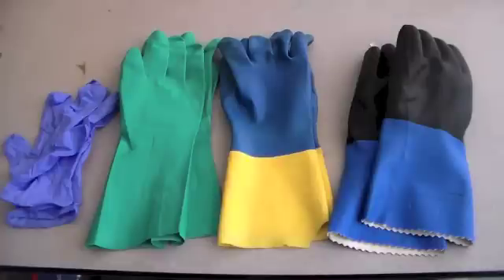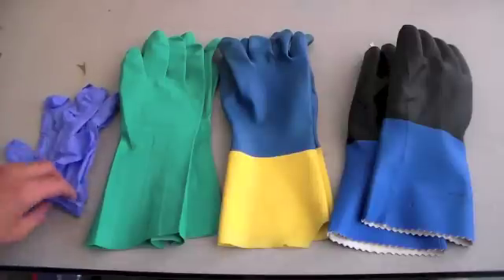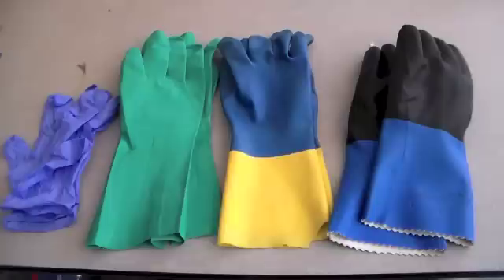Wearing gloves is very important because they protect your hands, but it's also important to wear the right kinds of gloves. There are a number of instances where wearing the wrong glove can actually get you seriously injured. For example, some gloves might not be able to withstand certain chemicals, and those corrosive chemicals could get onto your hand and burn your hands. Also, fuming nitric acid will react with disposable nitro gloves and latex as well, and it will ignite them on contact, which can be a very, very bad thing.